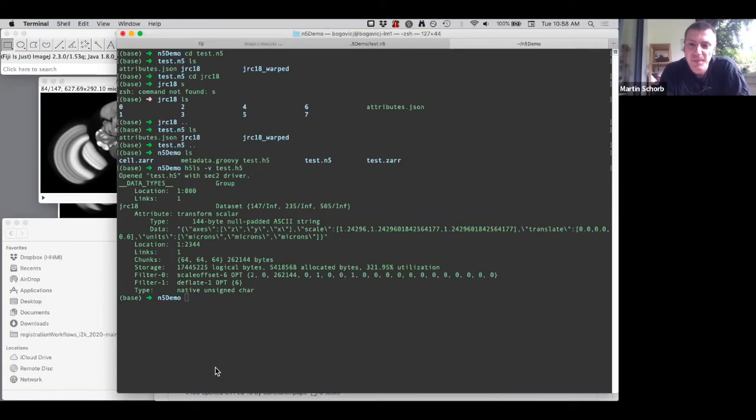Yeah, I completely agree. Part of my thinking, and discussing with people locally and elsewhere, is learning to interact with images in a slightly different way, in the sense that for the huge images that EMBL produces and that Janelia produces, you don't want to have to download a terabyte in order to work with an image.